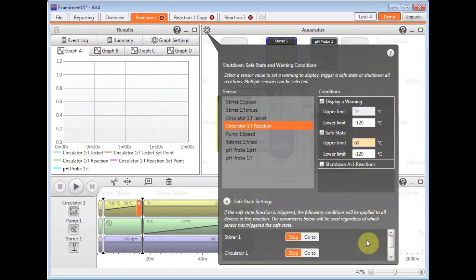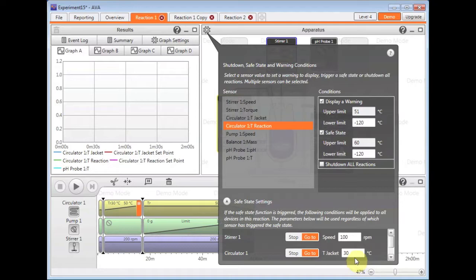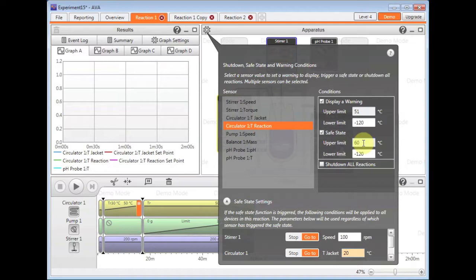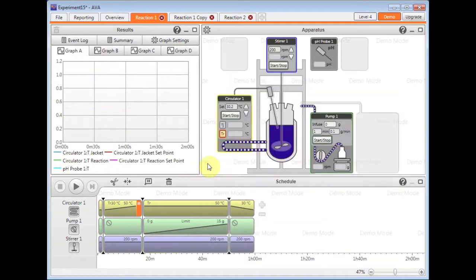But for the circulator to actually crash cool down to 20 degrees and obviously for our pump additions to stop. So what will happen is if the reaction were to go above 60 degrees is that the safe state will be triggered and all these values will be set to their set safe values. Again, another very useful safety feature of the AVA software.